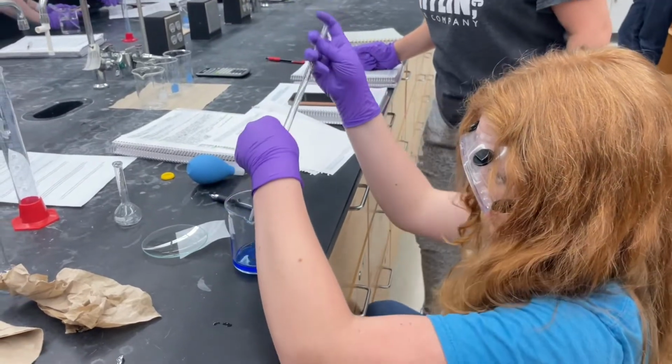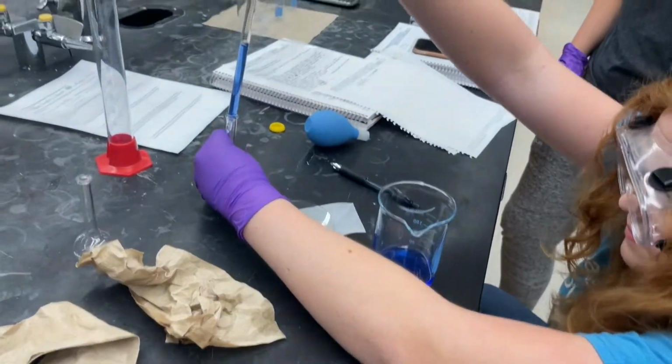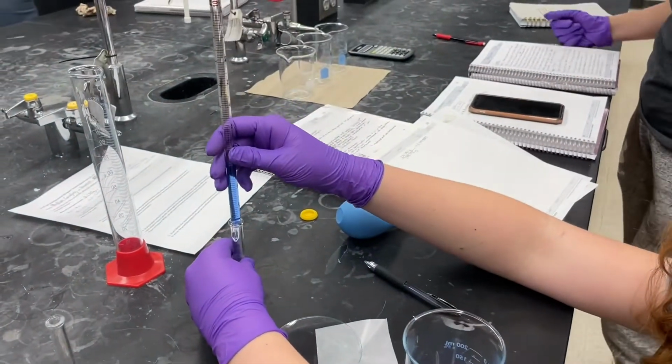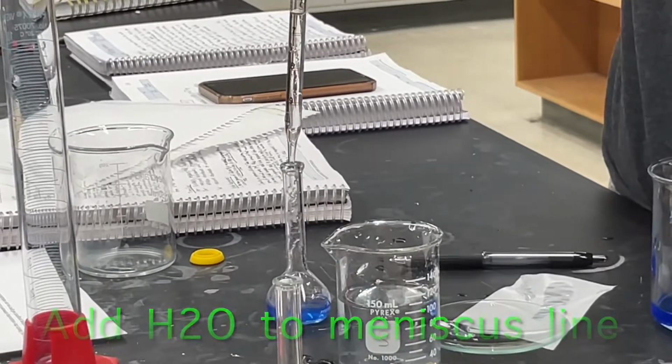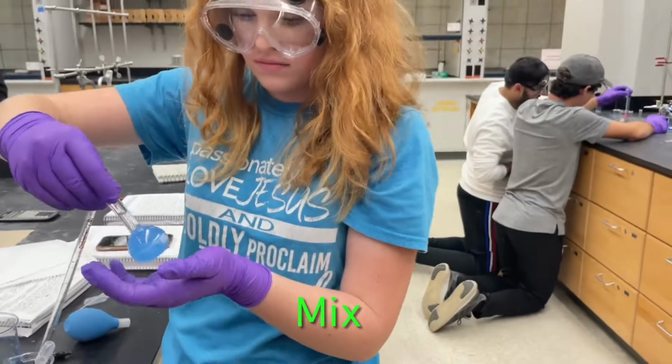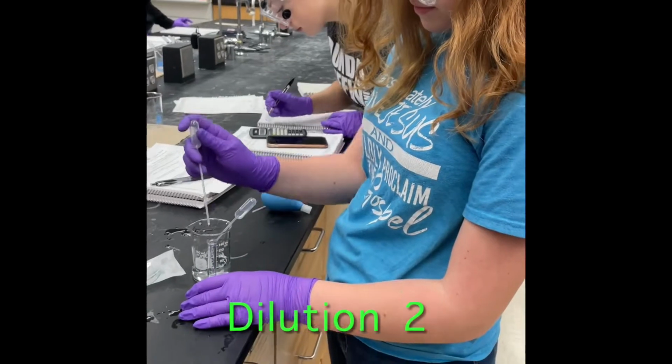Then, we took some of the stock solution out and put it in the flask. We took out 5 milliliters of stock solution. We did this to make our first dilution. In order to make that dilution, though, we had to add water. We added about 20 milliliters of water to the meniscus line. After that, we poured it into the beaker and we had made our first dilution.